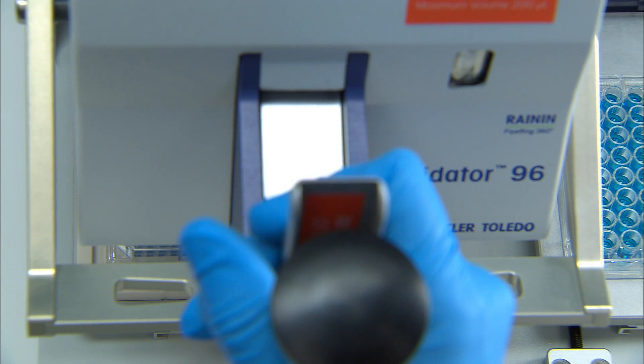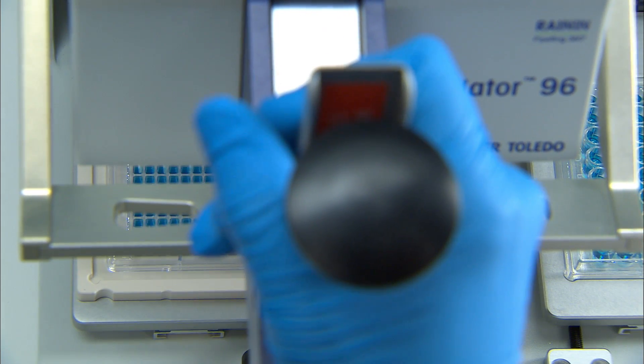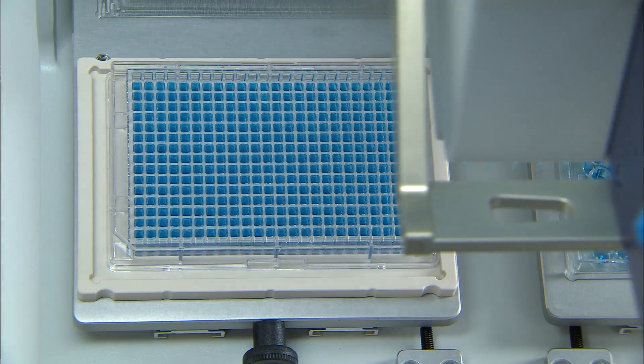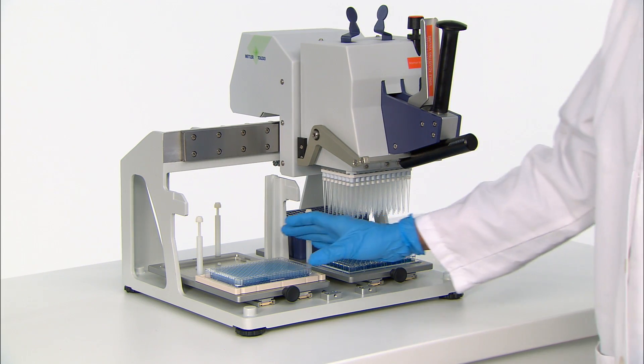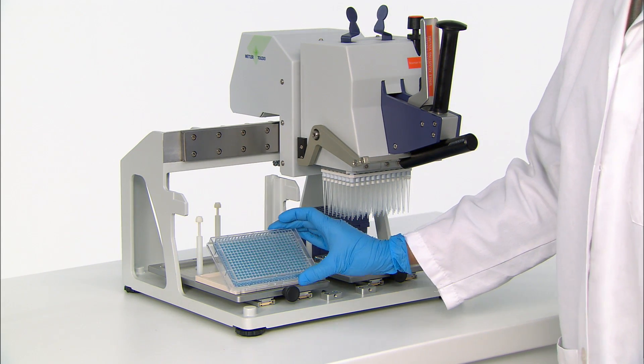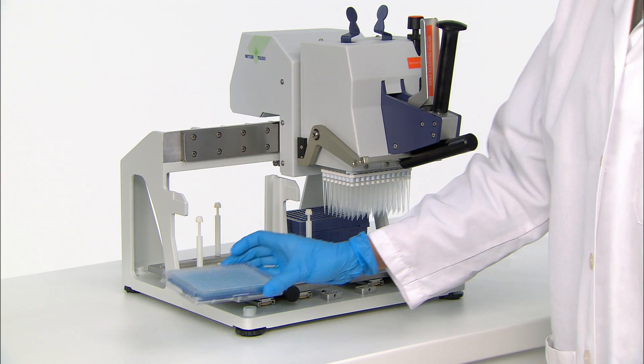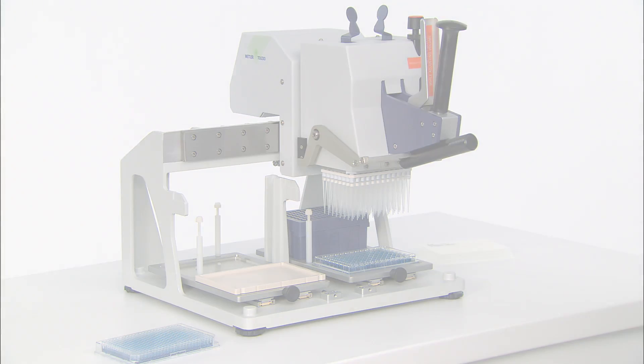As we've seen, there's virtually no setup time. Plates can be filled without much preparation anywhere in the lab or outside the lab, since neither a computer nor electricity are needed to run the system. We hope you've enjoyed watching this demonstration of the Liquidator 96 in action.